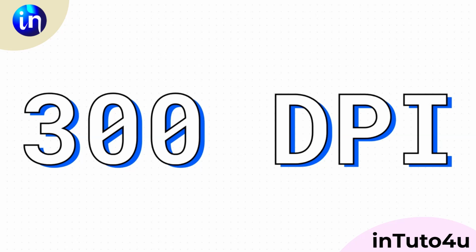And for that resolution, there is one number you absolutely need to remember, 300 dpi. That stands for dots per inch, and it is the gold standard for high-quality printing. If you set your export to 300 dpi, I guarantee your graph will look sharp and professional in any journal, on any poster. No blurriness.